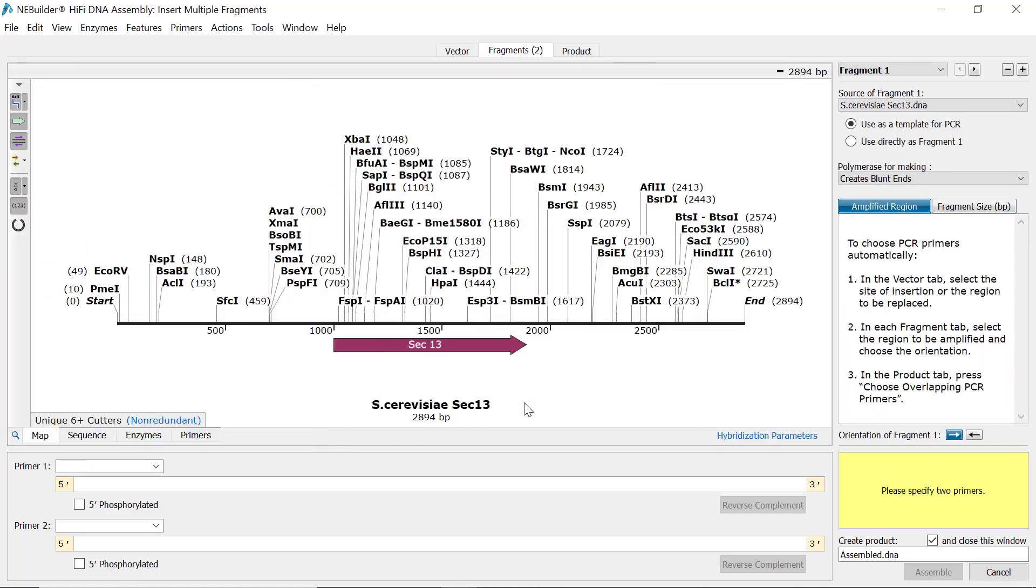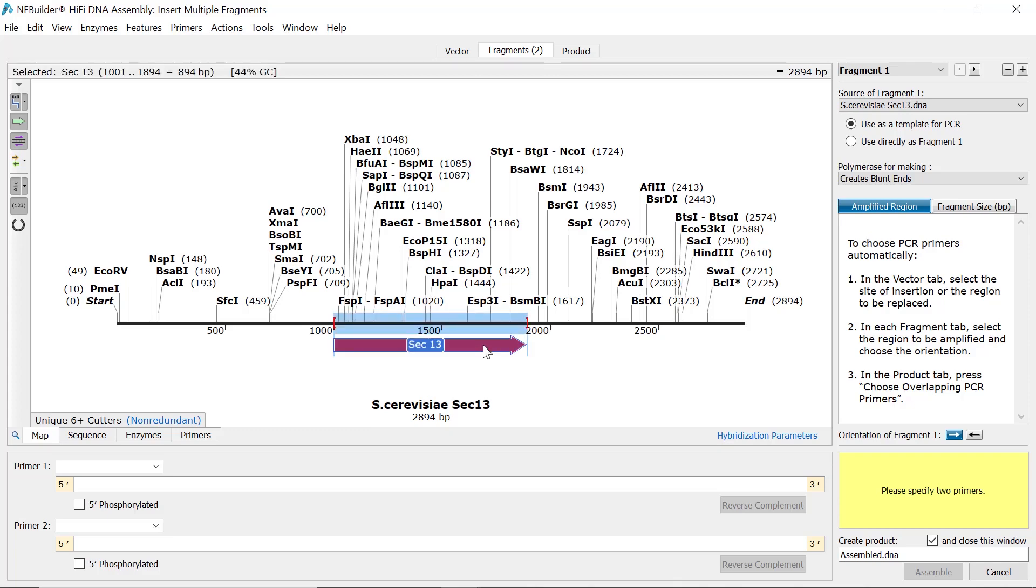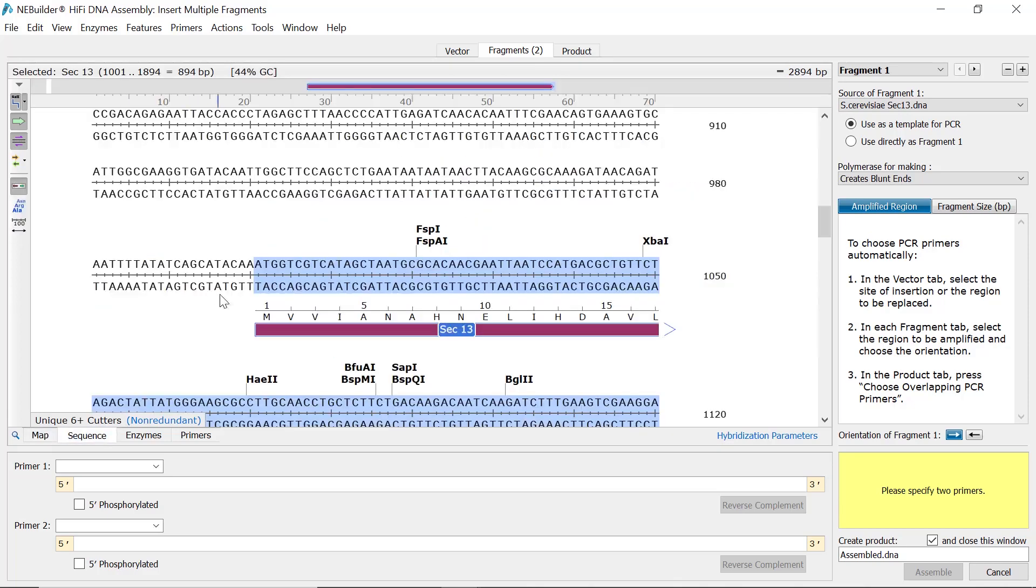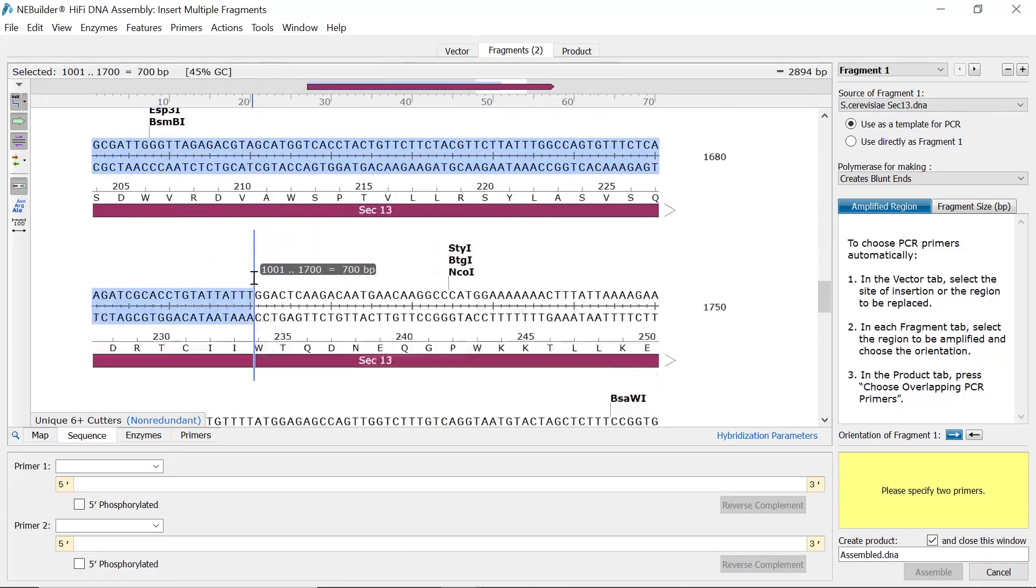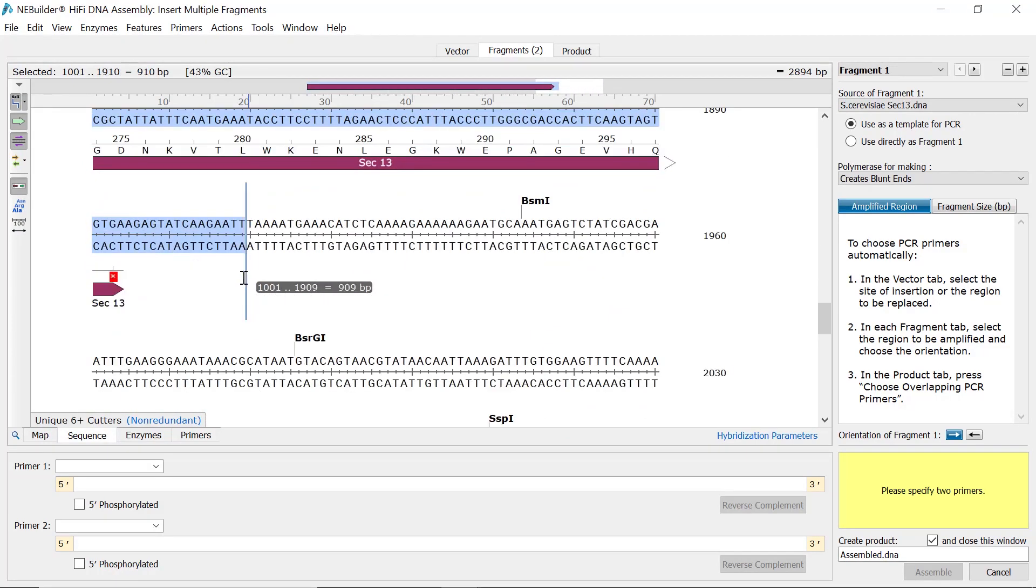Starting with the first fragment file, you now need to select the sequence you want to use as the insert. To do this, you can either select a feature in the map view, or you can switch to sequence view and click and drag on the desired sequence.